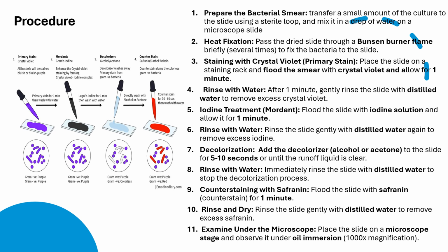Iodine treatment, that is the mordant. Flood the slide with iodine solution and leave it for 1 minute. Then rinse with water. Rinse the slide gently with distilled water again to remove excess iodine.